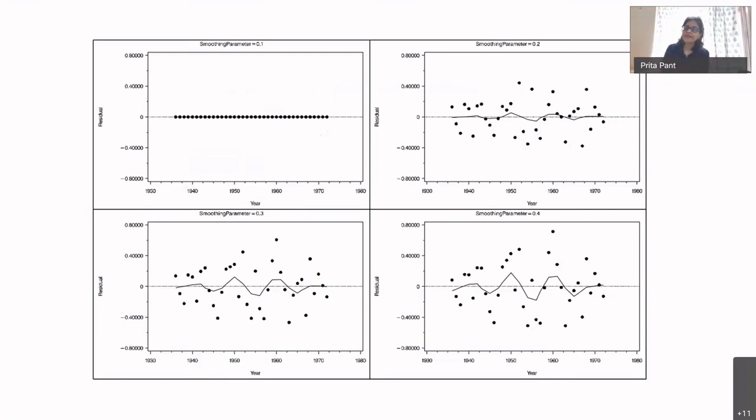So somewhere here, one has to use one's judgment as to which is the smoothing parameter to fit. And you will see that when you work with our SU8 data as well, you could fit to 10 points, you could fit to 20 points, 30 points. What makes sense? There isn't necessarily one recipe for that. You try it out and then you see what you get.